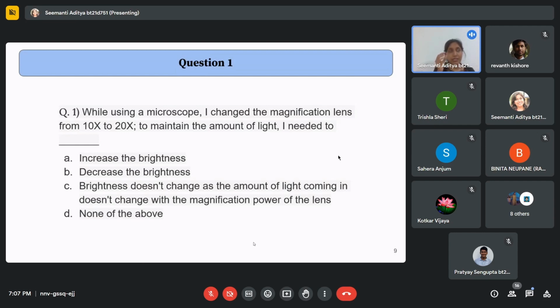It means that the lenses are becoming finer, thinner. In order that the light should enter the cells, sorry, I was saying it is independent, it is not independent.